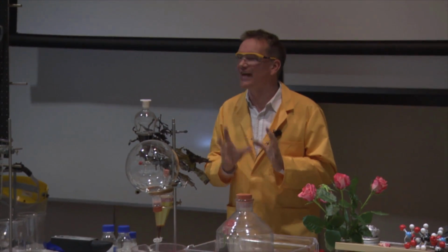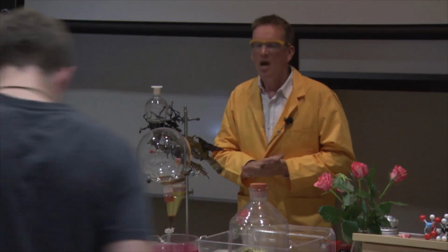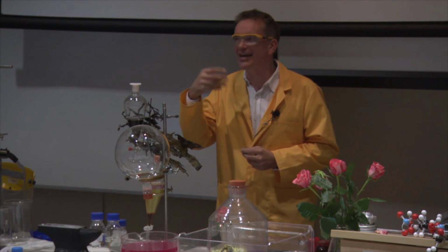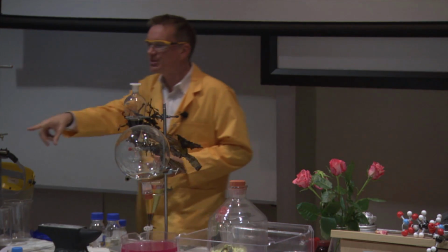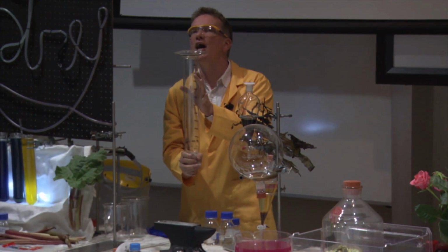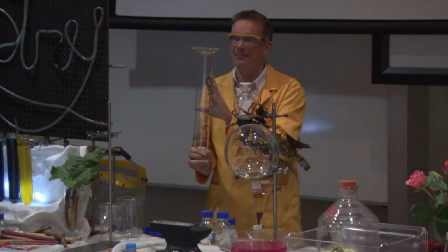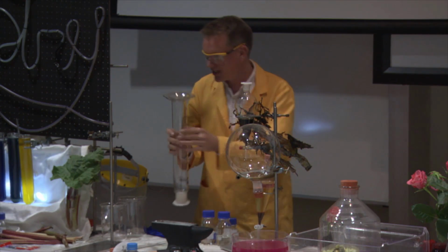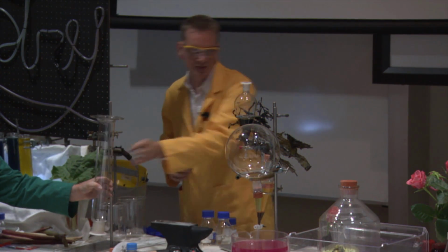So ammonia itself is a gas, okay, and that's what you can smell. You can smell the gas coming off there. Now I've put some of the gas into this tube, and ammonia is lighter than air, okay, so it can stay in the tube even if I took the top off. And actually I need a rose. Can you just hold that for me, please?